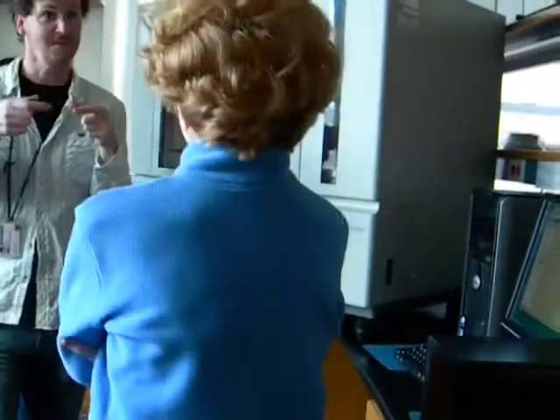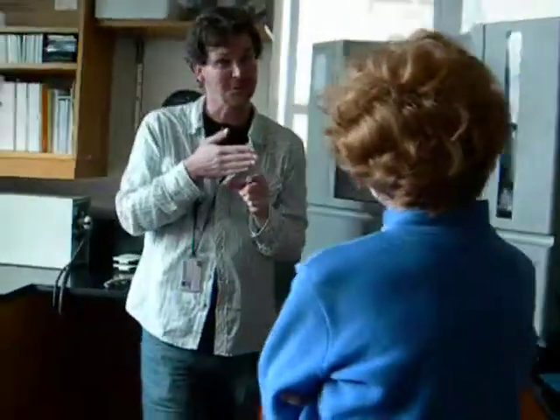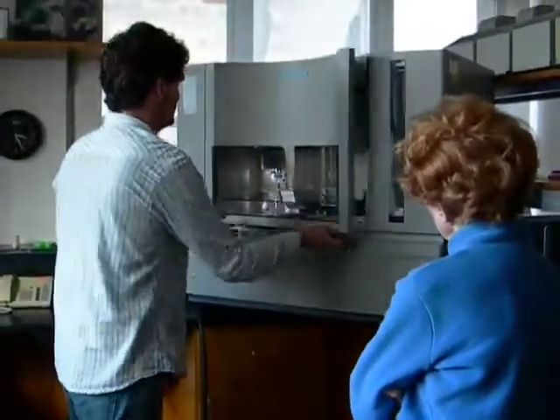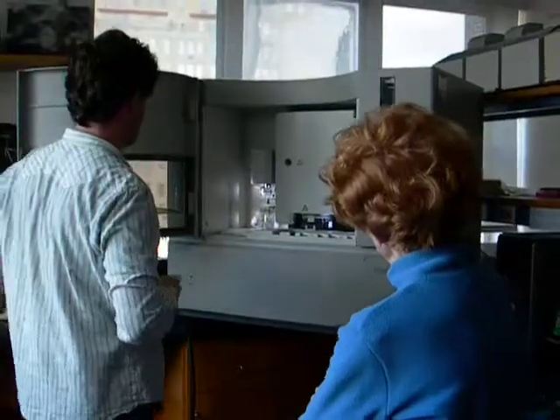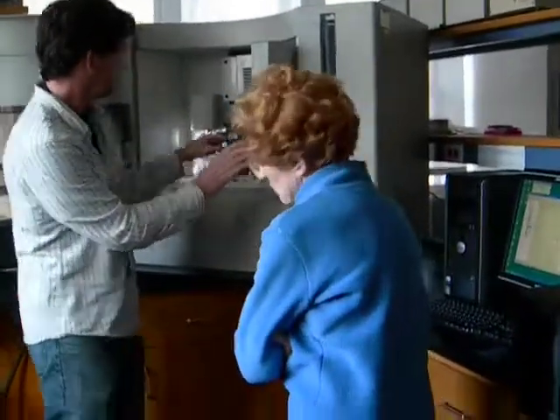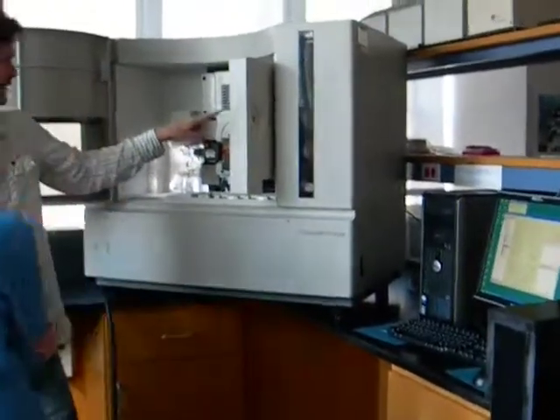Basically what this next machine is doing is analogous to the gel — where you have an electrical current in the gel and the DNA migrates through it. In this case, we have a bunch of very thin hollow tubes called capillaries.